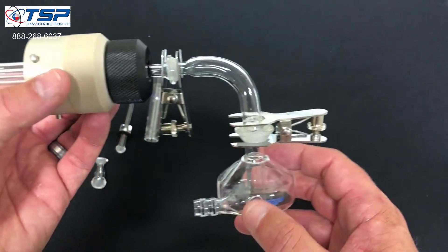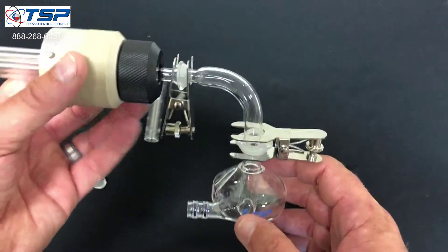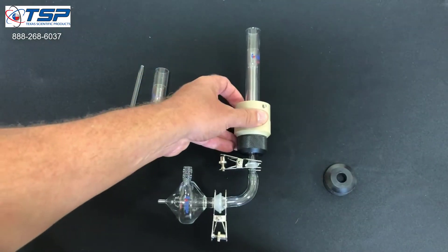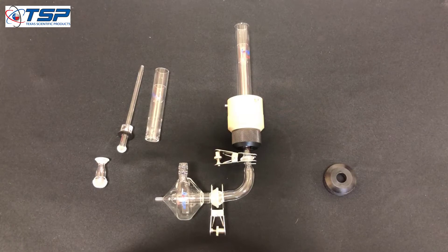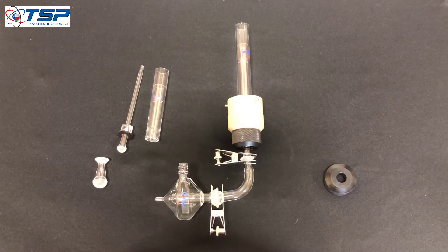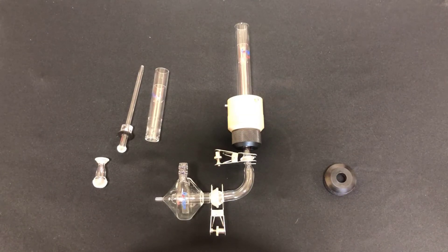That's it. If you have any questions about the assembly of either the radial or the axial system on the Arcos MV, give Texas Scientific Products a call at 888-268-6037. We'd be happy to talk to you. Thanks.